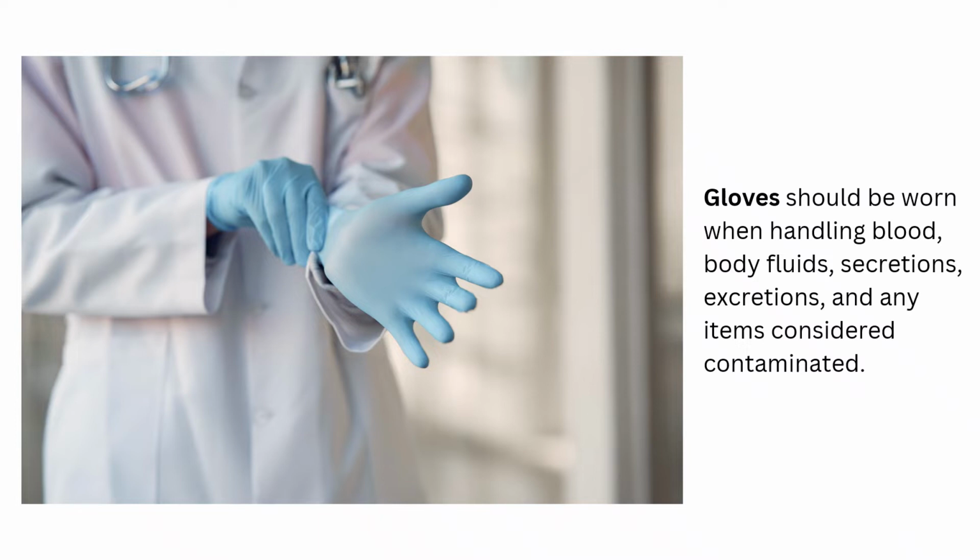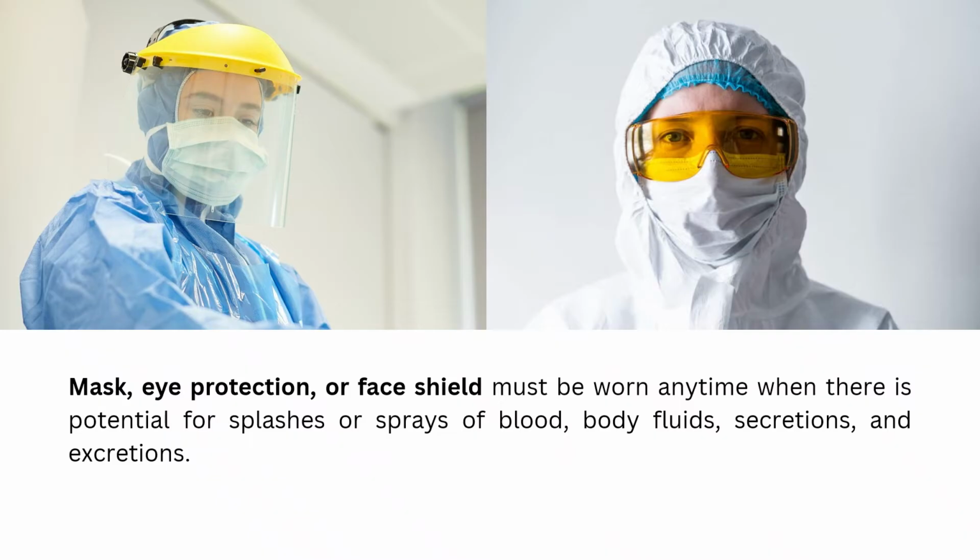Remember, class, the laboratory gloves are not puncture proof. That is why you're still advised to take extra precaution when using your gloves, especially when you're dealing with sharps or needles. The mask, the eye protection, and the face shields must be worn anytime when there is potential for splashes or sprays of blood, body fluids, secretions, and excretions.